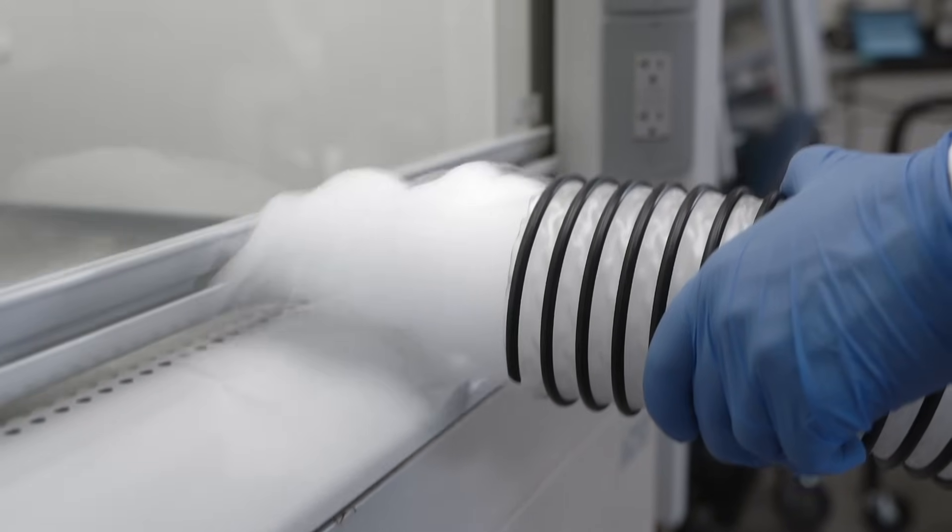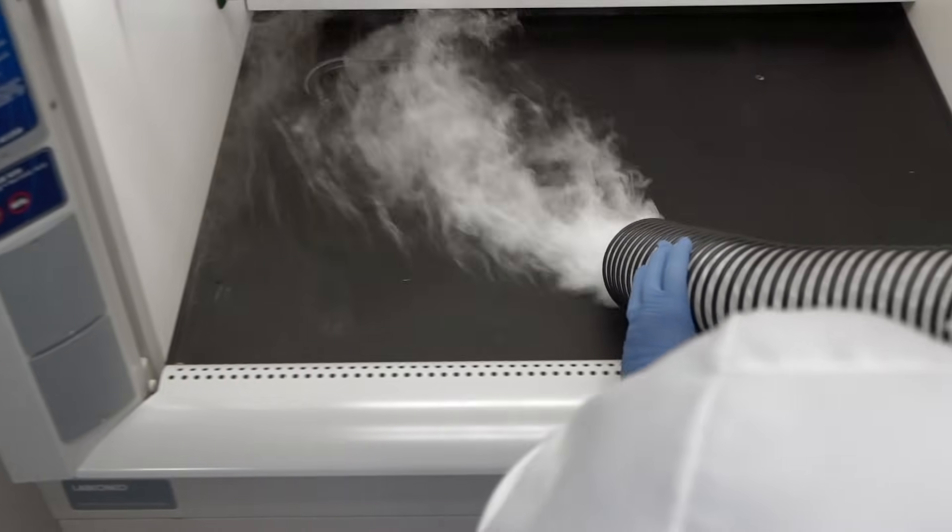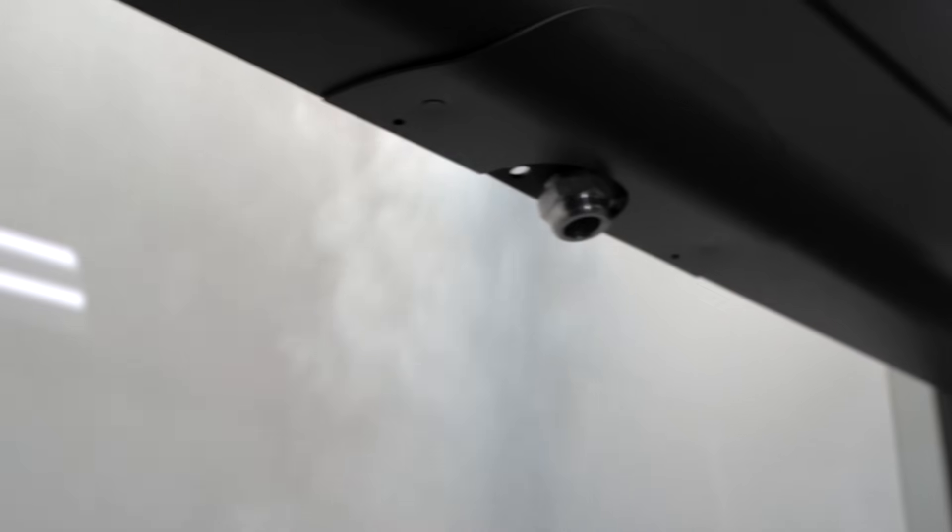Bypass hoods are designed to minimize fluctuations in face velocity as the sash is lowered or raised. Air enters the hood through openings along the top of the hood and underneath the airfoil, even when the sash is in the fully closed position.